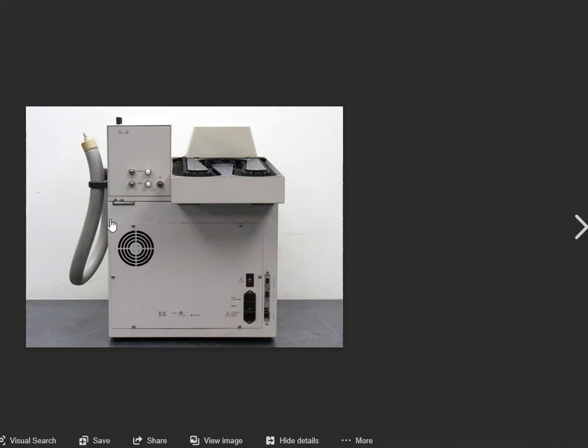And then finally, what I like about this picture, this is the hose that transfers your prepared sample over to the GC. And if you take a look here at the very end, that is your injection port. So this goes down into the injection port of the GC and it locks in place and you secure it. Again, if you don't want to use the Headspace box, no big deal.